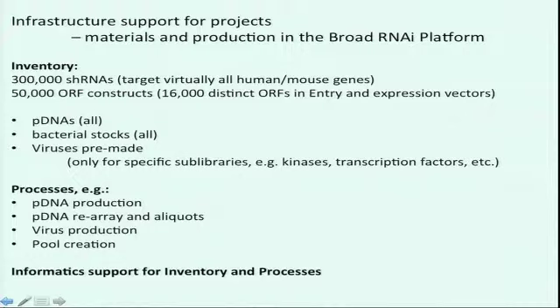So I'm just here to talk a little bit about the infrastructure support that we have here in our library. This includes the materials we have, like our whole TRC library, and also a couple of production processes that we have here in place.